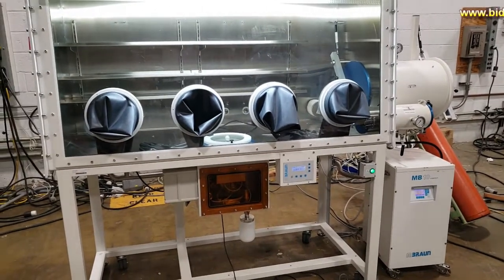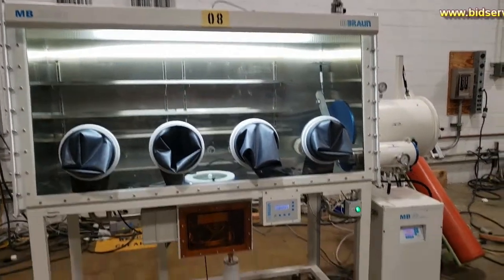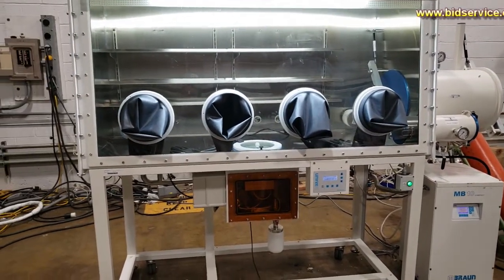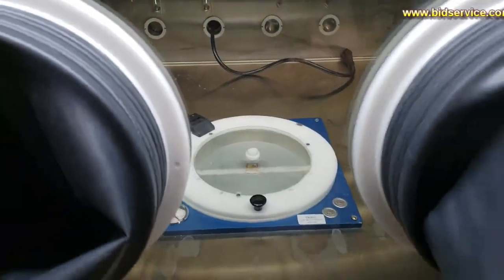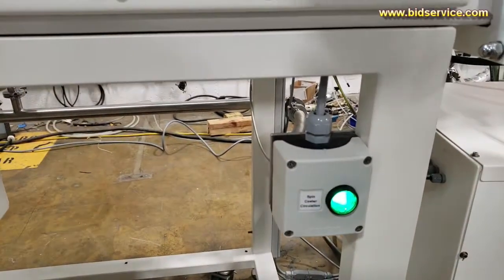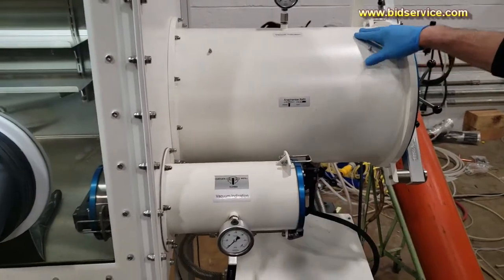This is our video demonstration of the Embron MB-200B using the MB-10 Compact Purifier, the circulator box. This also has a spinner. There's a control box for the spinner here. You can go to the button here that allows circulation through the bottom of the box. Two antechambers, large and small, both manually operated.